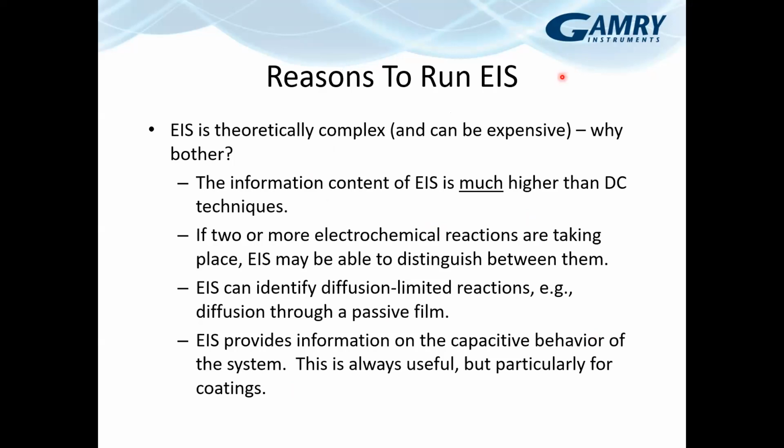So why do you want to run it? It's theoretically complex. It's more expensive than other, even electrochemical, techniques. So why bother? And the reason is that the information content of EIS is a lot higher than most DC techniques. There are other advantages to this.